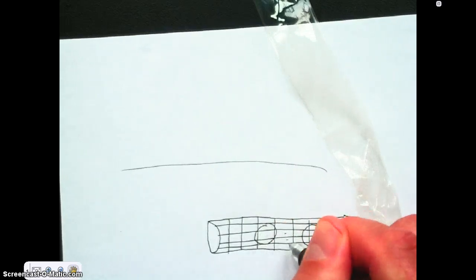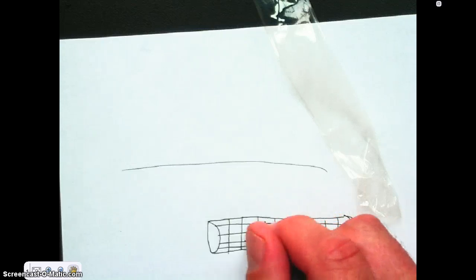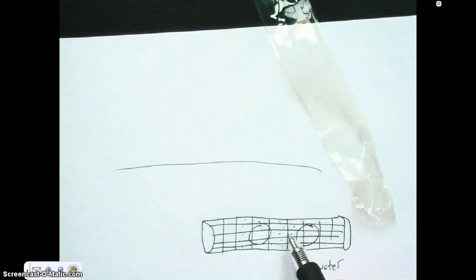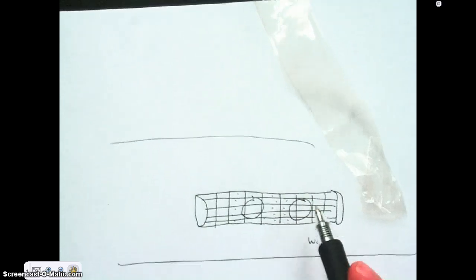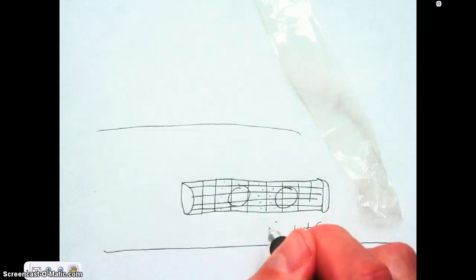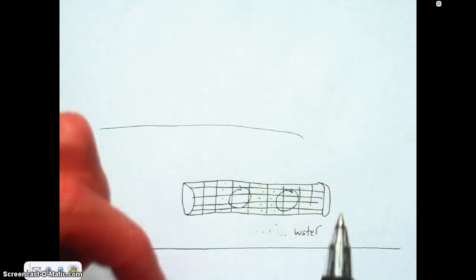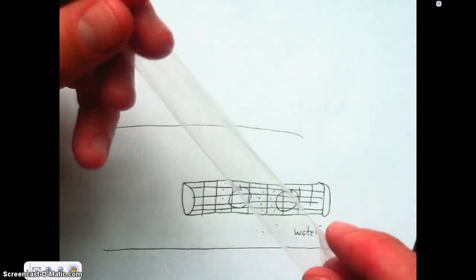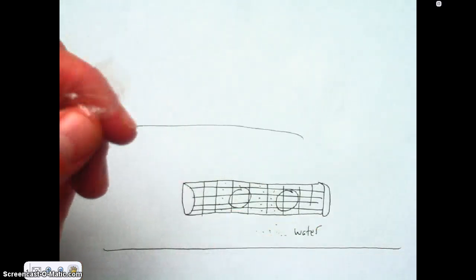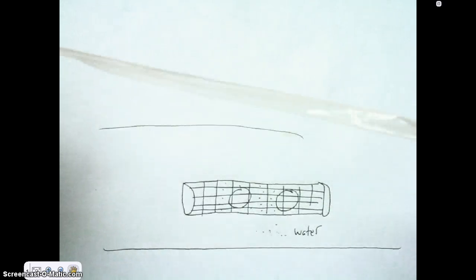The toxins that are in your blood that your kidneys would normally be filtering out, there are none of these toxins in the water surrounding the tubing. But these toxins and waste products are so small that they can, by diffusion, get out of these tiny holes and make their way into this water. So this is called dialysis tubing. And again, it is a semi-permeable membrane because it discriminates against particles based on the size of those particles. I'm going to give you a piece that's about 6 inches long, as you can see that I'm holding here.